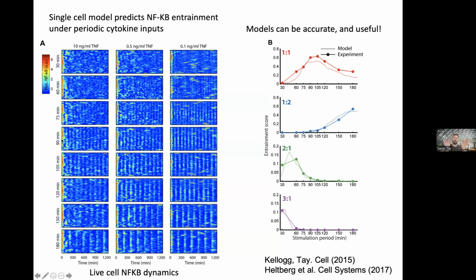These are repetitive pulses over time, like a pulse train. And then live cell microscopy has been performed. Every data set here contains a few 10,000 data points, so this whole experiment contains about 1 million measurements. We are measuring NF-kappa B localization dynamics.